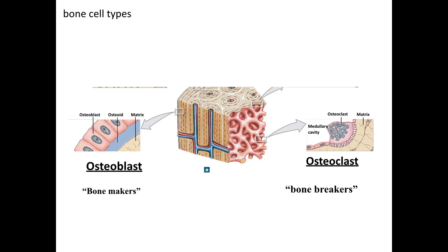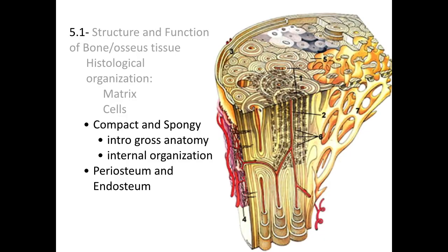So those are the bone cells within the bone matrix, and next we're going to look at the organization of the bone tissue.